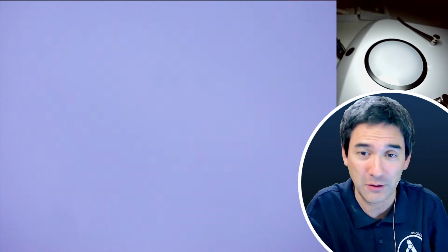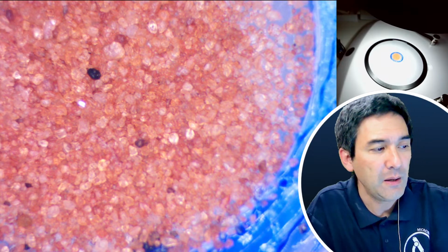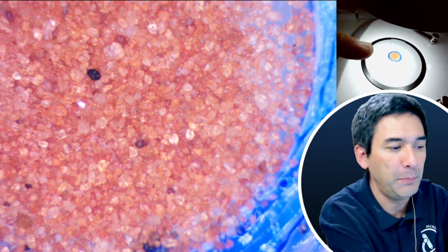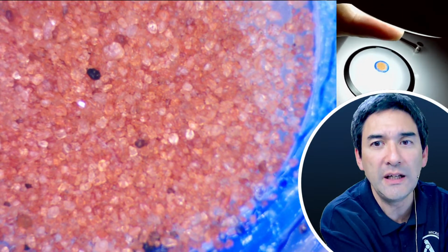Microbehunter, if you would illuminate the sand specimens from the side by using a bright flashlight or other light source, would this cast shadows? Thank you for the comment. Look, I'm going to try this again. You know what? I'm going to use the flat one. Okay, let's go back to the Kalahari one. So basically the question is, can I change the lighting technique? I'm now using at the top an LED ring light.